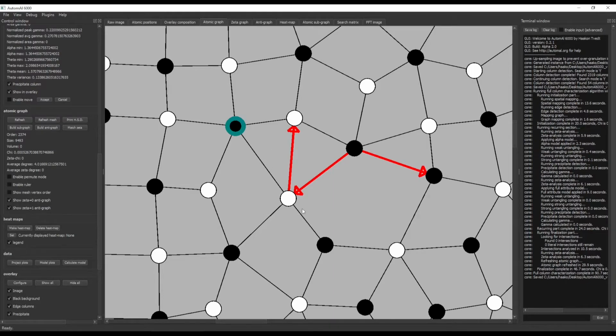Now you start to see how this can go pretty fast. We see this one is pointing here, which is the same plane, which is wrong. It should be pointing to this one. So if I press spacebar, pivot point, old point, new point. Here we have the same: this is pointing there, should be pointing there. So I press the pivot, old, new, and then I disable permute mode.